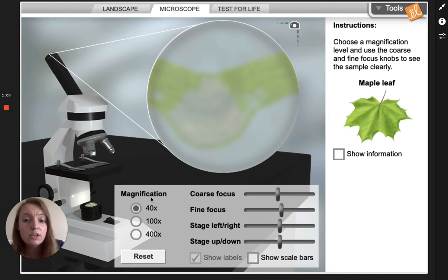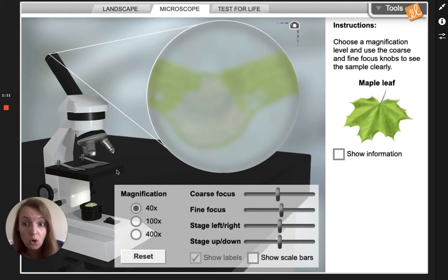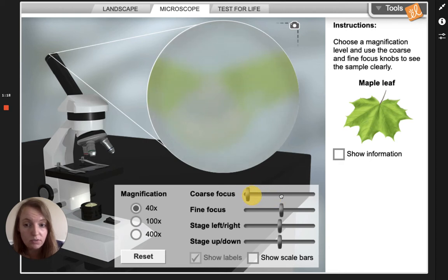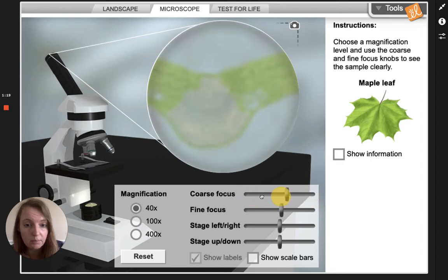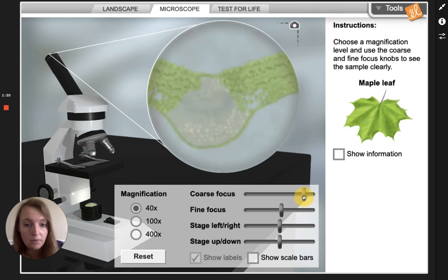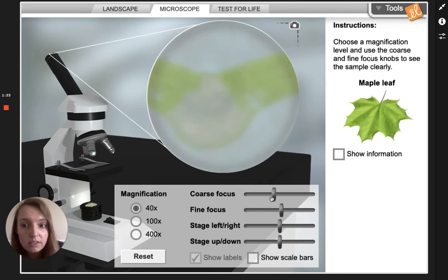For the 40x I'm going to use the coarse focus. The coarse focus is going to move the stage — that's the part that's holding the slide — up and down. See, if I move this you can see the slide moves up and down. What I'm gonna do is get it in focus.